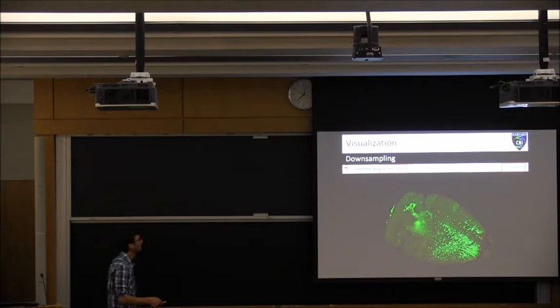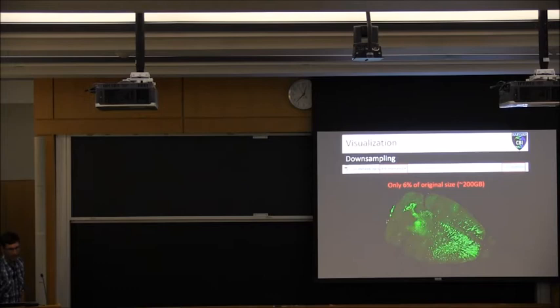Okay? So when you're looking on this scale, it looks totally fine, no big deal. And this image is now only 6% of the original size of about 200 gigs. But there is a trade-off when you do this.